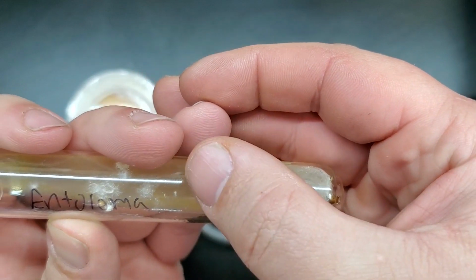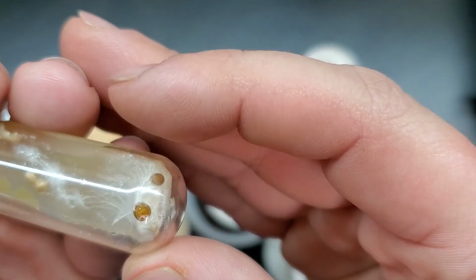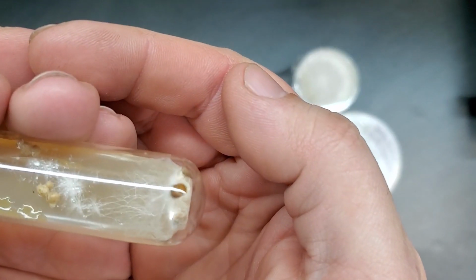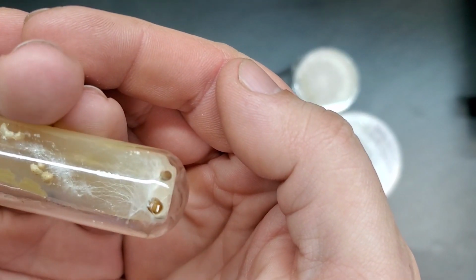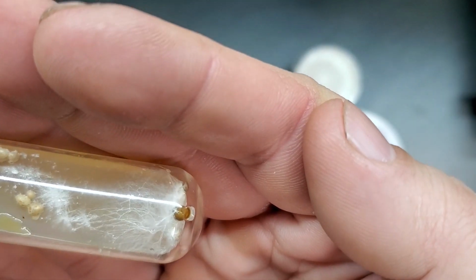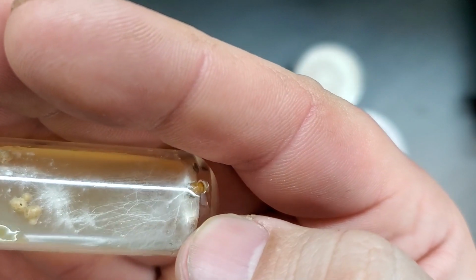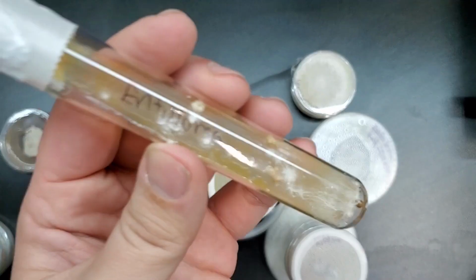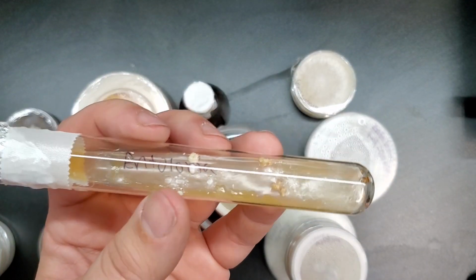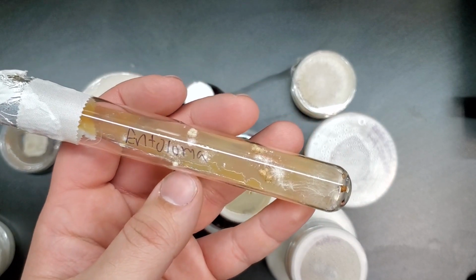and right here. But at the bottom down here, it also has what look like what I would expect mushroom pins for this species to look like. Look at that. And look at that nice rhizomorphic mycelial growth right there going to these little mushroom pins. That's pretty cool.